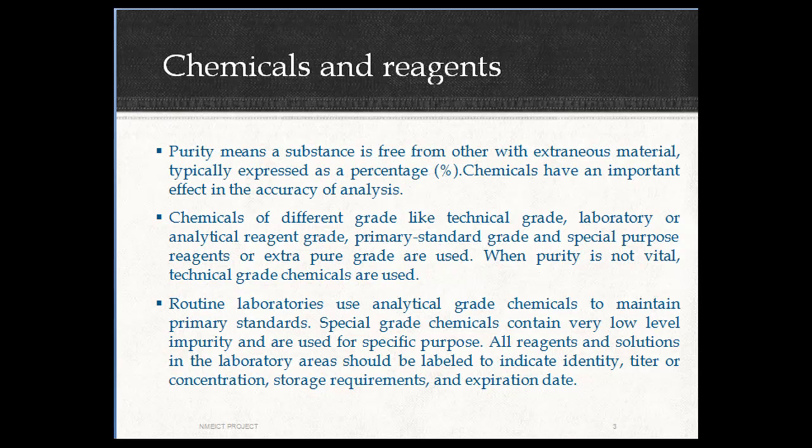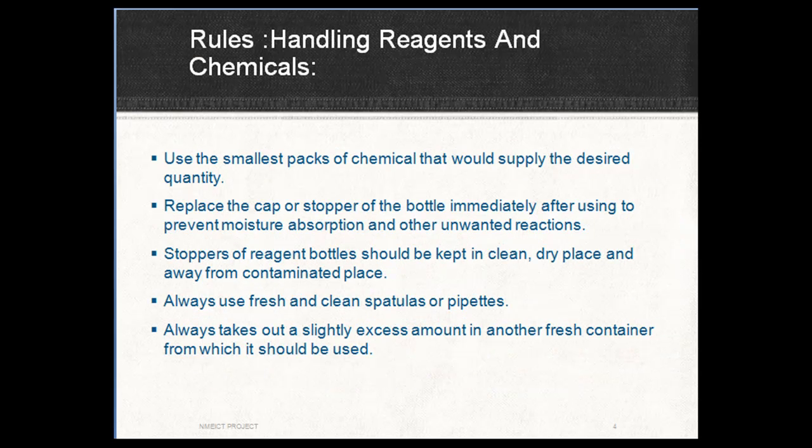When purity is not vital, technical grade chemicals are used. Routine laboratory work uses analytical grade chemicals to maintain primary standards. Special grade chemicals contain a very low level of impurity and are used for specific purposes. All reagents and solutions in the laboratory area should be labeled to indicate identity, titer or concentration, storage requirement, and expiry date. The following rules must be followed while handling reagents and chemicals.